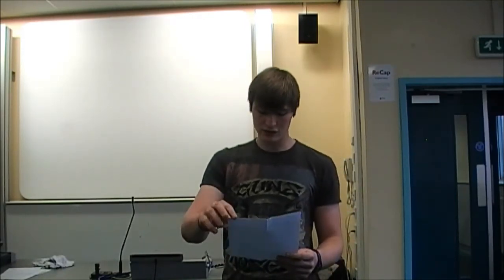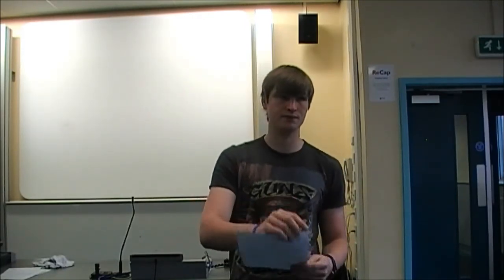Fourier was a very important mathematician around the end of the 19th century. He worked out that waves could be deciphered by turning them into complex numbers. He used sine and cosine to create a single notation for the wave's amplitude and phase, while still making it accessible information, essentially simplifying the maths without affecting calculations. This gives a very clear diffraction pattern, which is useful for defining the symmetry groups in the crystal. It is a symmetrical distribution of the diffracted waves.